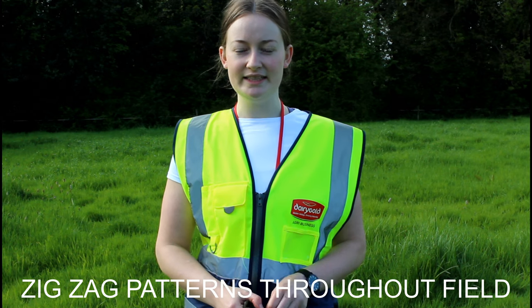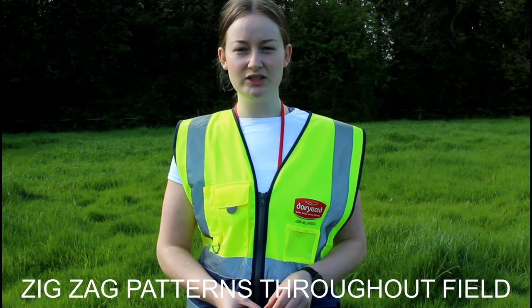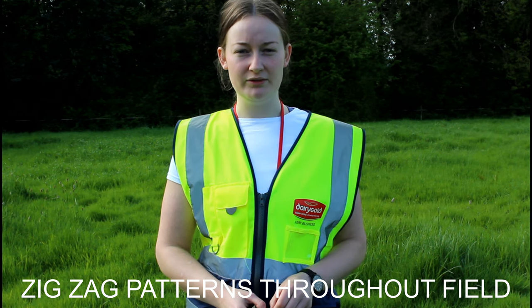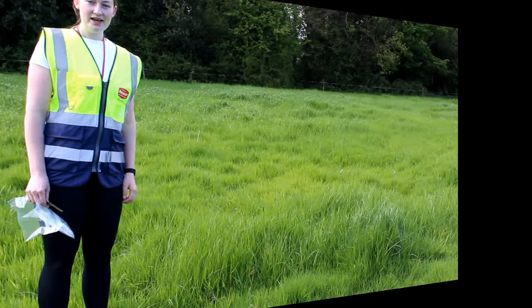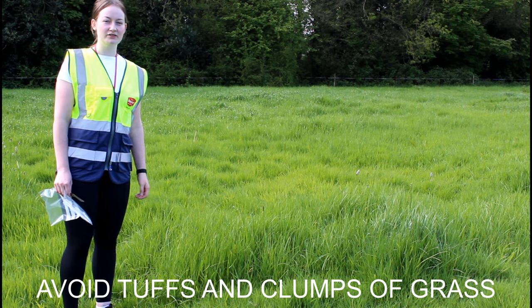Samples should be taken in a zigzag pattern throughout the field. Areas to avoid are gateways, tufts, and uneven areas of the field. Tufts of grass like this should be avoided as they won't give accurate results of the grass.